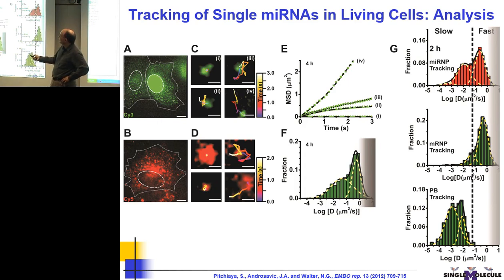Okay, and so particle number one here, which is stuck, it's immobile, shows basically no movement, therefore has a flat curve. A particle that has corralled motion, so stays in an area but diffuses around a little bit, shows this increase and then leveling off, because at some point the boundaries are reached and it can't get out. And then random diffusion shows this linear increase, and then this super diffusion or biased diffusion here shows this curvature upwards because the particle is faster than you would expect from random diffusion, which gives a linear plot in this particular way.